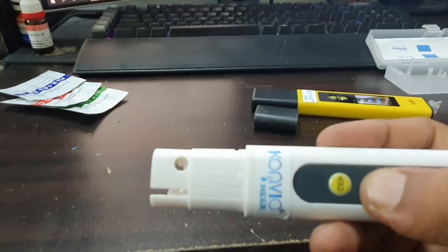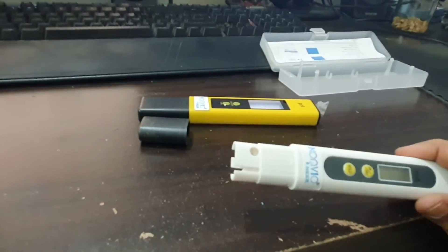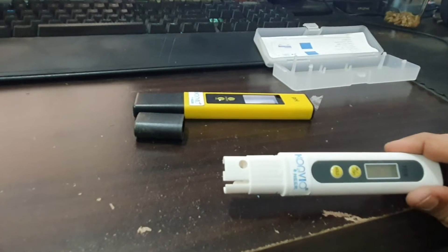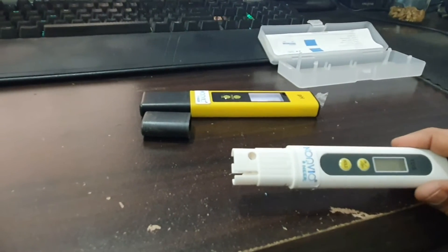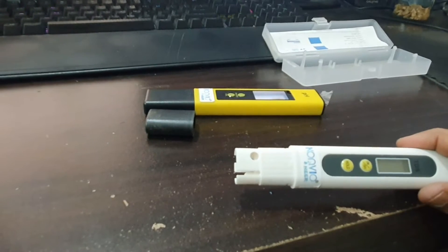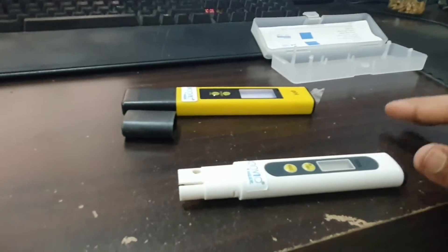Before testing, I checked the PPM ranges online. The ideal range is 0 to 50. Around 50 to 200 is like filtered water. 200 to 300 is marginally acceptable. 300 to 400 is considered high TDS water, like from a tap, which should not be consumed.